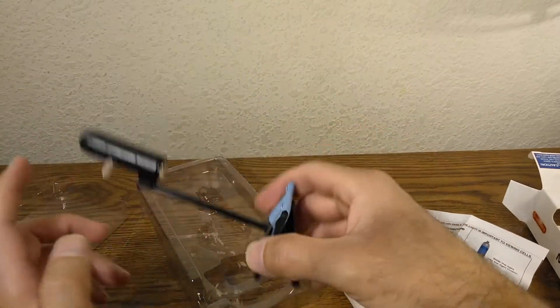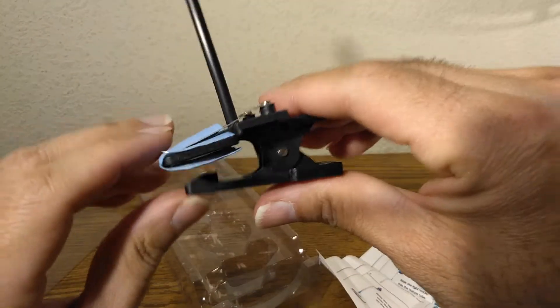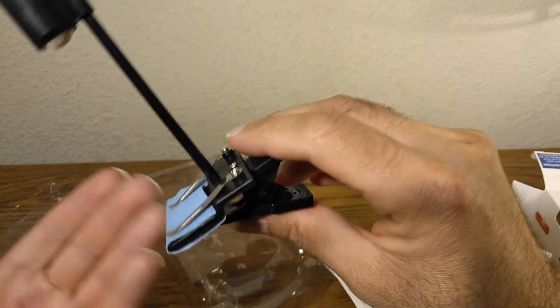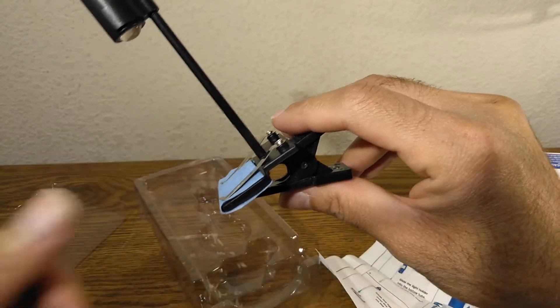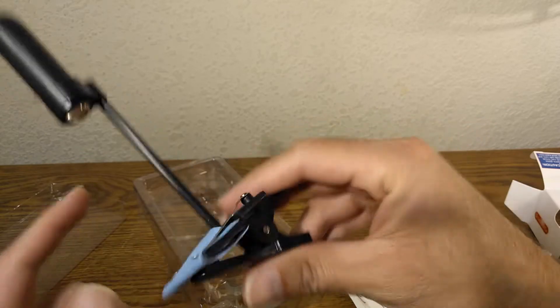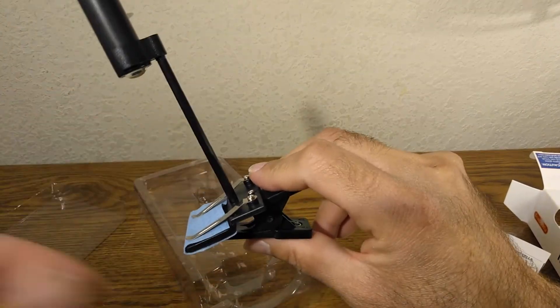Basically the way this works is that you connect this to your phone on the front camera — not the back, but the front camera. Then you open the camera app, go to selfie mode, make the alignment, and then you're able to see whatever you want to see.